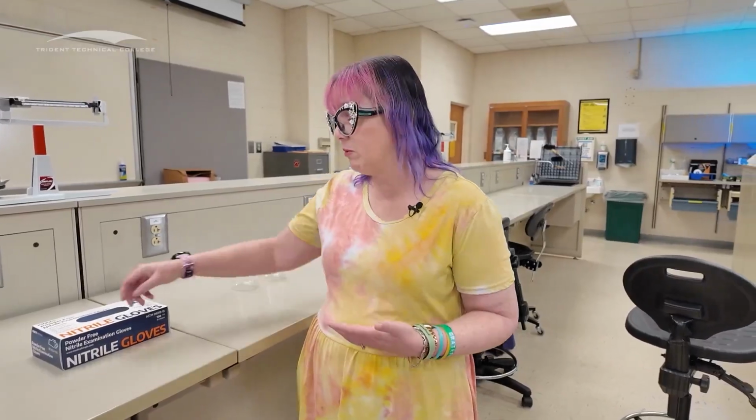For these, it's necessary. So I want to show you how to properly put on a pair of gloves, how to take them off, and then talk about what are proper protocols for using those gloves in those experiments. So let's talk about how we put those gloves on.